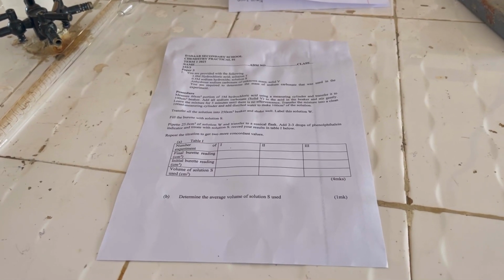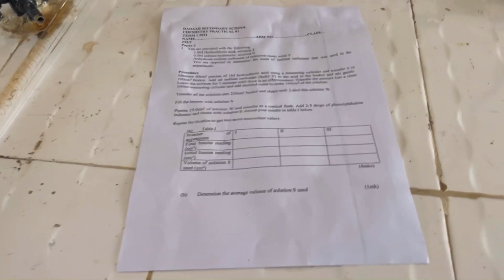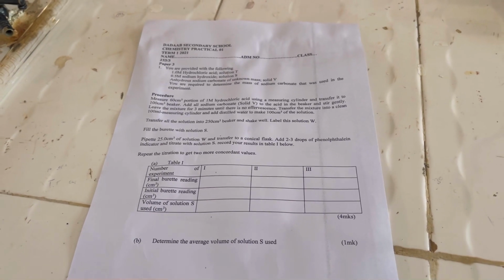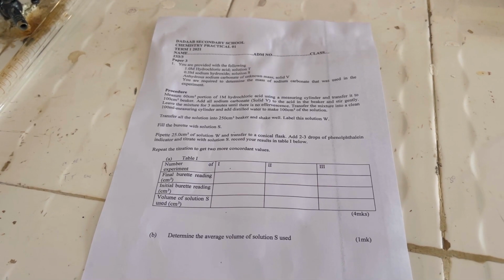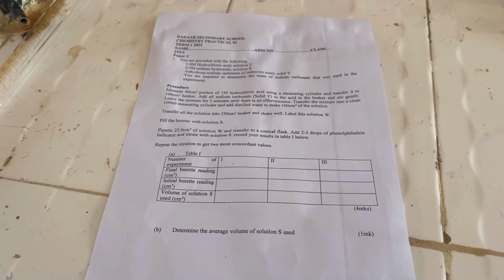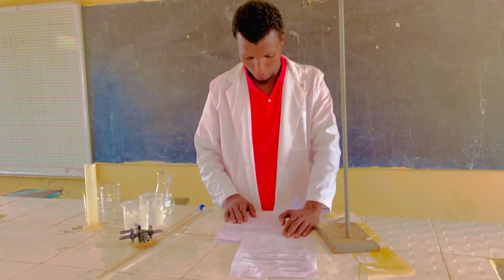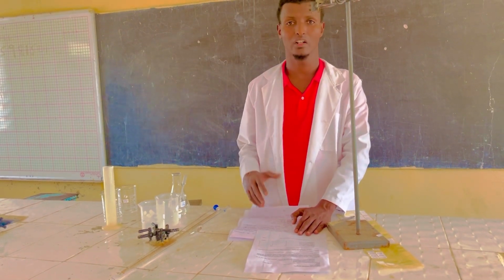Titration is one of the analyses tested in KCSE Paper 3 as a quantitative analysis. Here with me is someone who is going to demonstrate titration that involves back titration. Here are the apparatus given. You are provided with a solution.